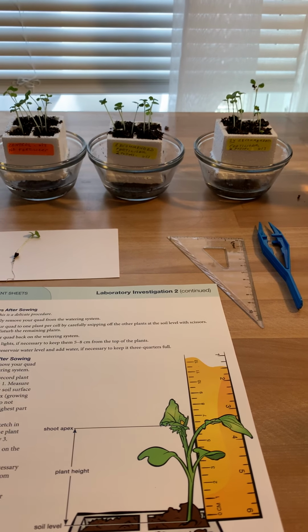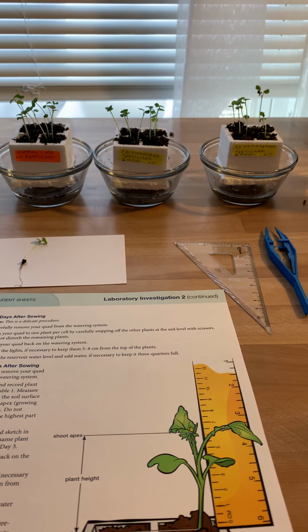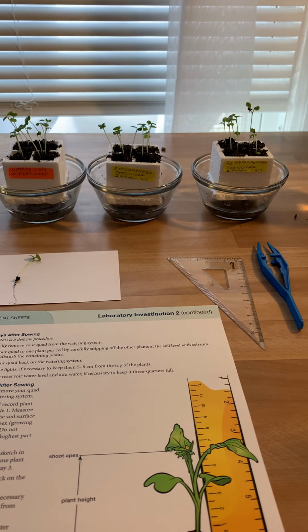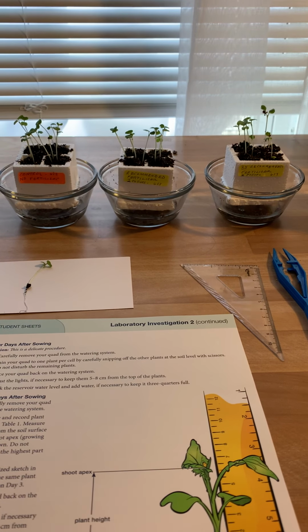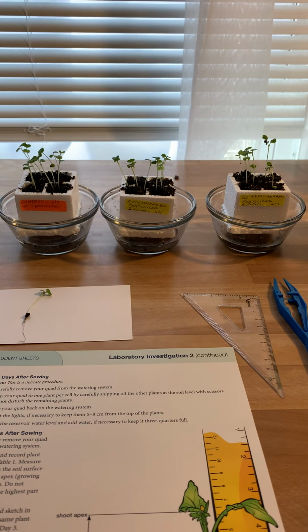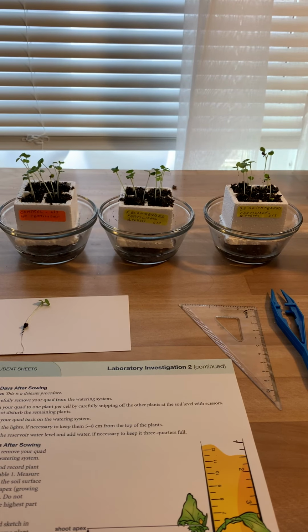Hello class. As you can see on day 4, for me, which is June 7th, because I planted these on the 3rd, there's a lot of plant growth. These are genetically modified, so it's not typical that in 4 days you'd have this kind of plant growth. Also notice that there's not the same amount of plants growing in each hole within the cell.